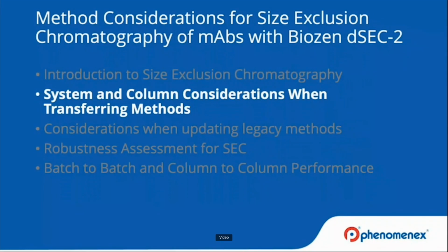So moving on from the introduction of the surface chemistry and the particle, and looking at how this might affect and benefit laboratories looking at method transferability.